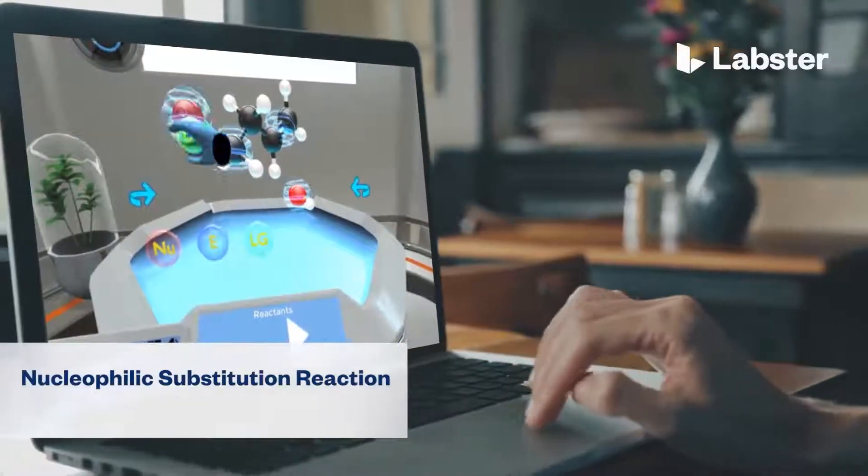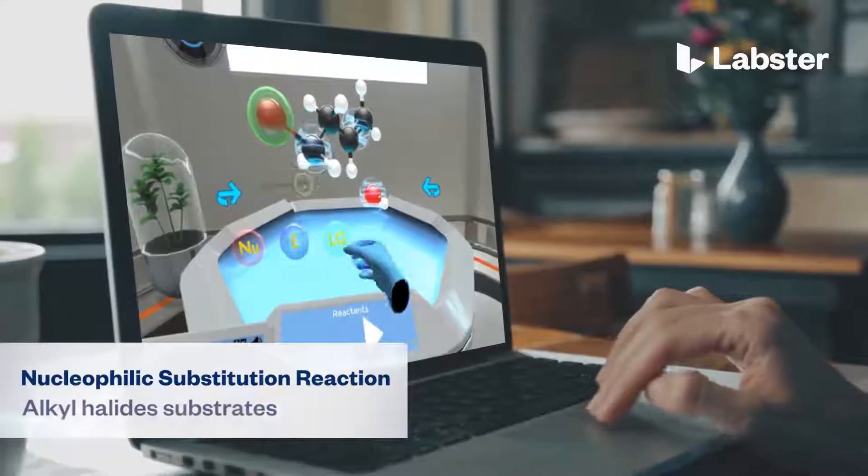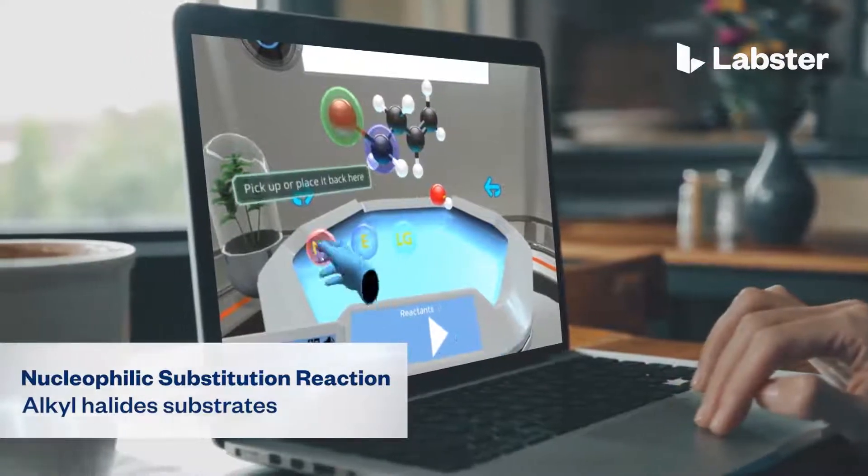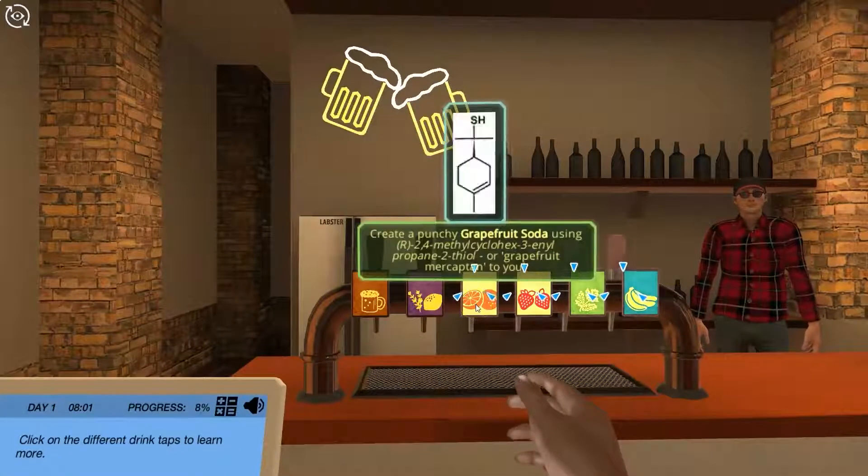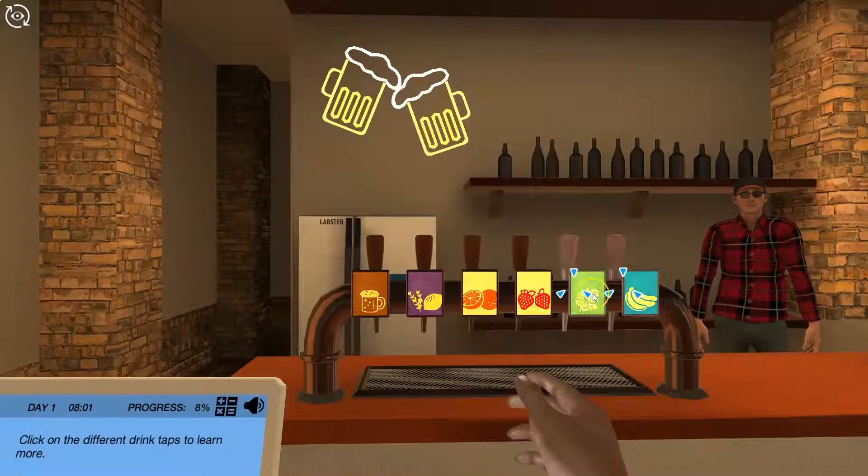In the nucleophilic substitution reaction, alkyl halide substrates virtual lab, students step into a realistic lab experience where they can practice, learn, and explore science in an engaging and immersive way.